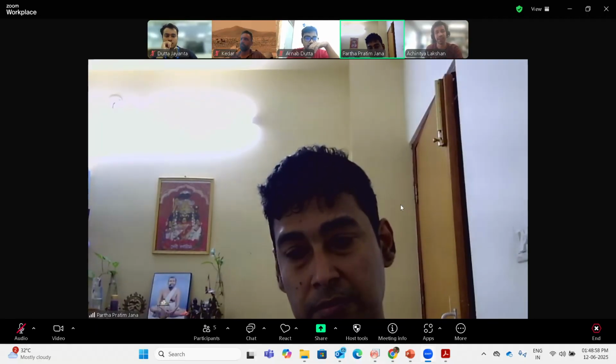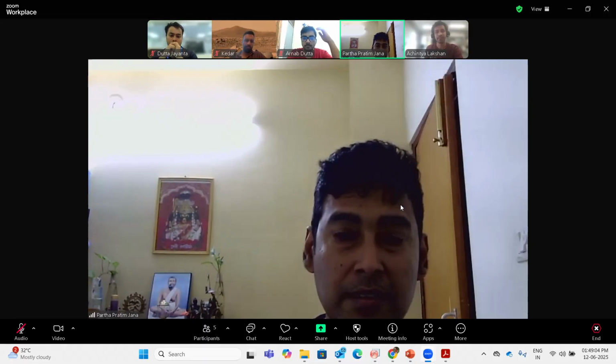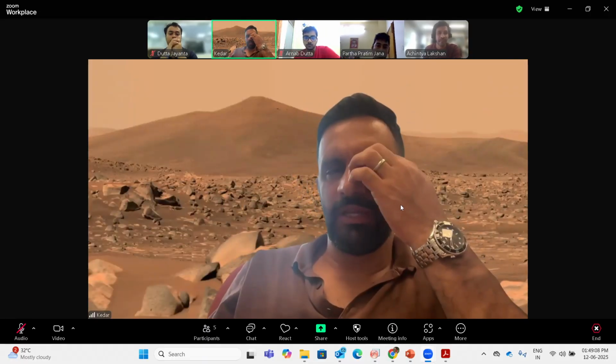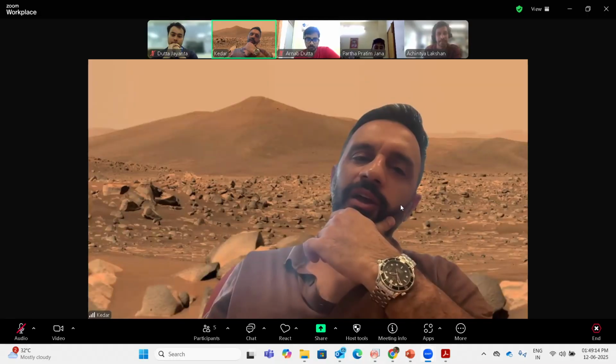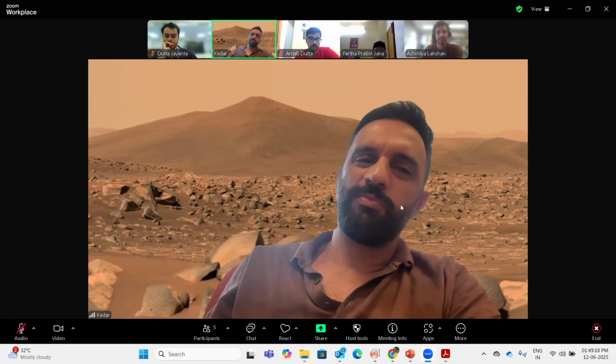So if we take the SAED pattern, Kedar, can you please give, what do you think? So it's doing SAED, you mean, right? Yes, yeah, we should be able to do it. Jayanta is preparing, I don't know which samples now because we have two of them, but he is learning how to do this PIPS.